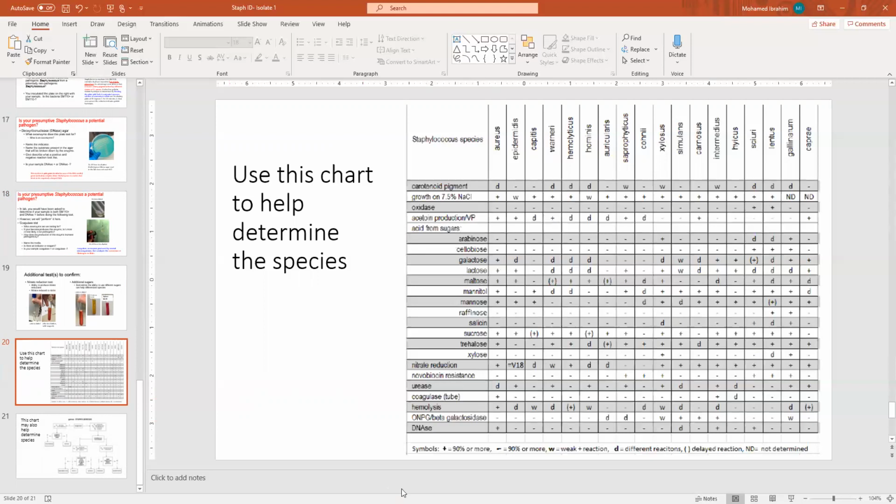One last thing I need to go through in the lab is basically, let me stop sharing here and go to, let me do this. Because this is very important, it is about calculating the number of colony forming units of bacteria, okay? About dilution and stuff like that.